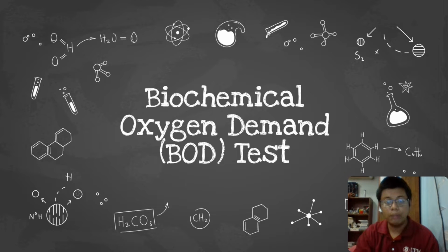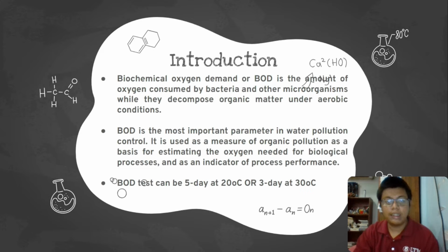So we are going to continue with the biochemical oxygen demand test, which is the BOD test. As you can see, biochemical oxygen demand, or BOD, is the amount of oxygen consumed by bacteria and other microorganisms while they decompose organic matter under aerobic conditions. BOD is the most important parameter in water pollution control.